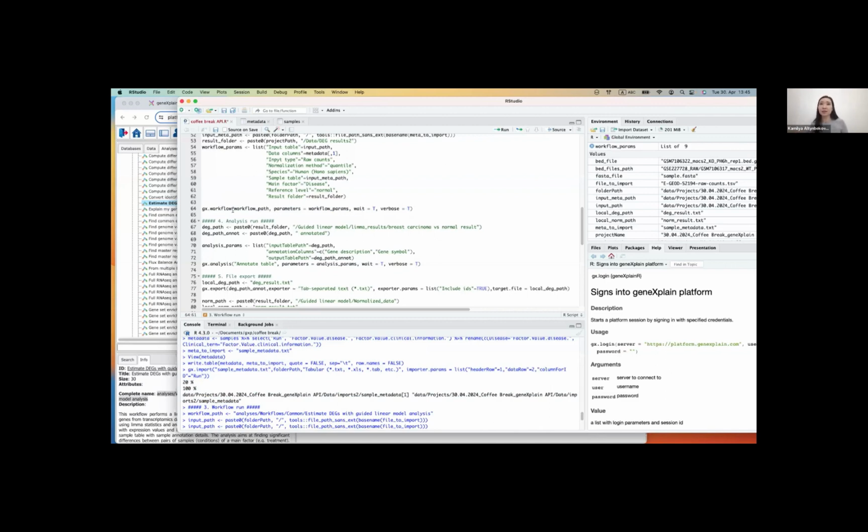If your analysis pipeline depends on the results of the workflow, you might set this to true to wait until the analysis actually finishes and then start working with the results. If, for instance, you just launch several analyses and they're not dependent on each other, then it's not necessary to wait for each workflow launch, so this can be set to false in this case.